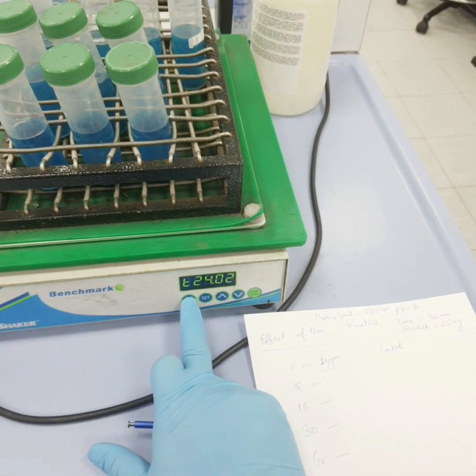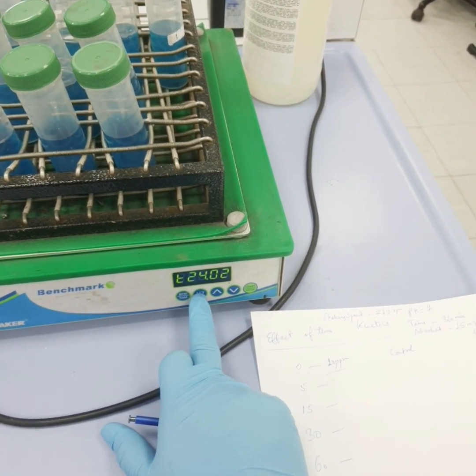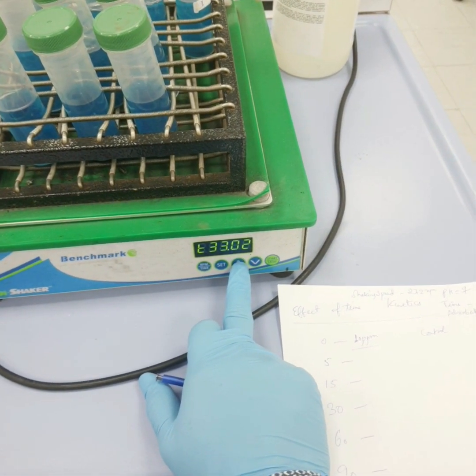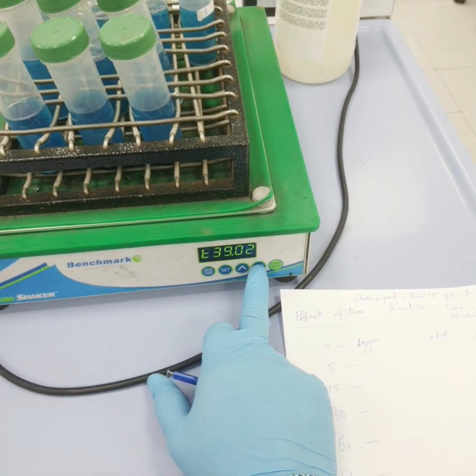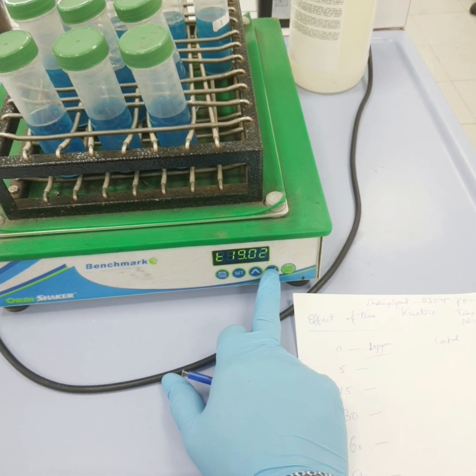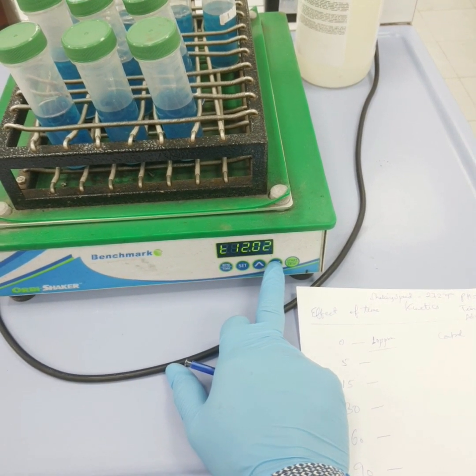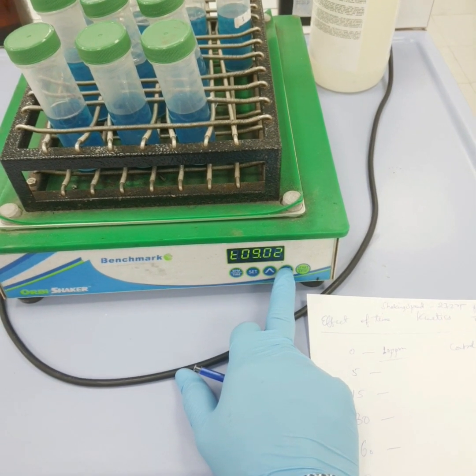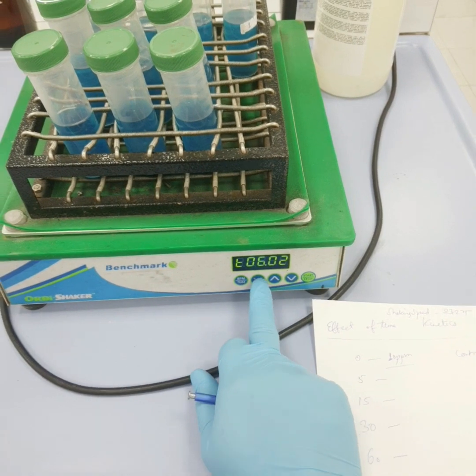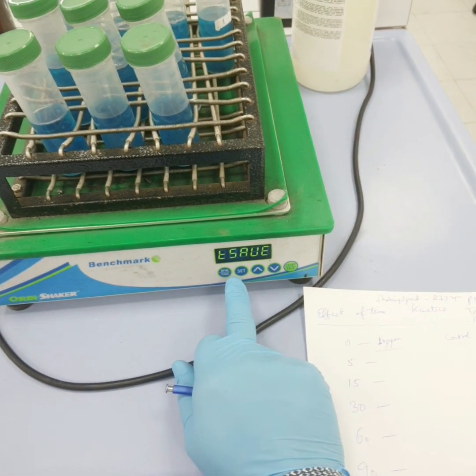Now let us first of all set the time. This is set around 6 hours.